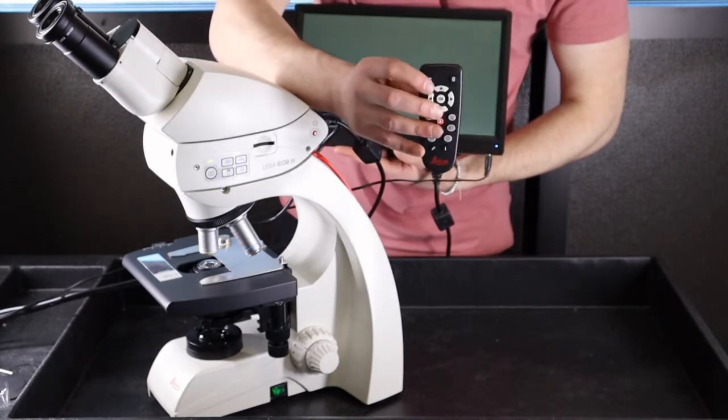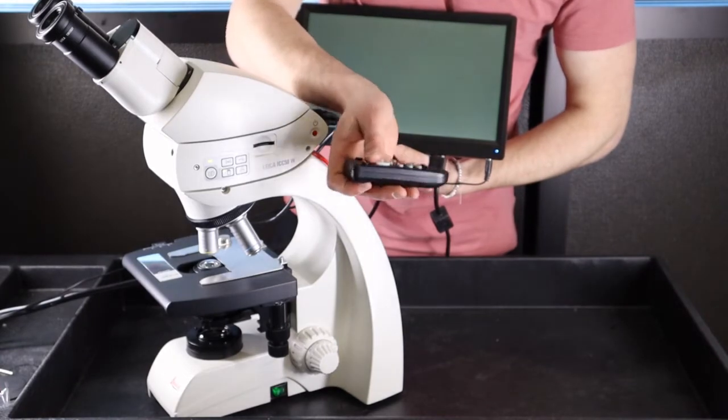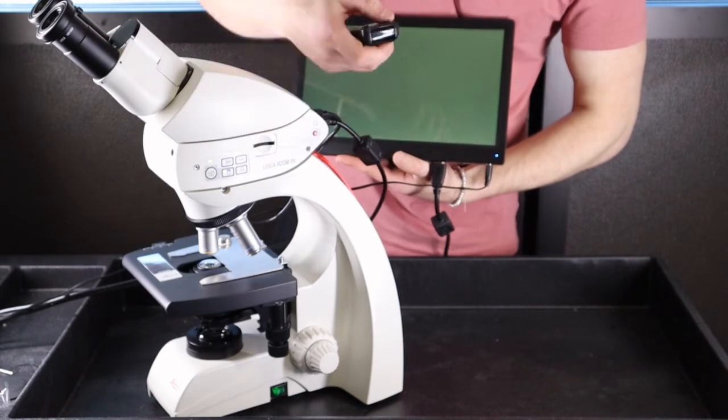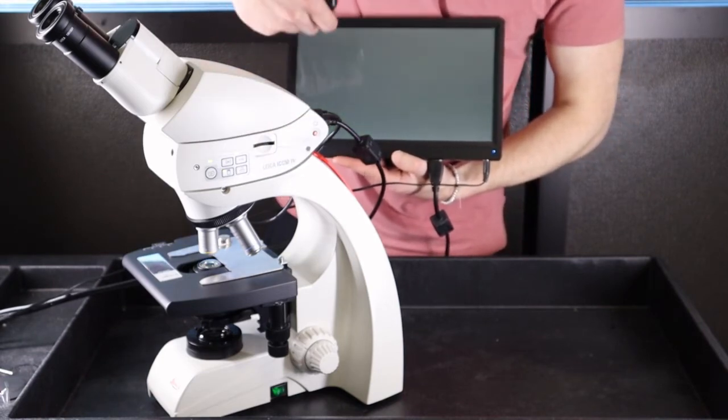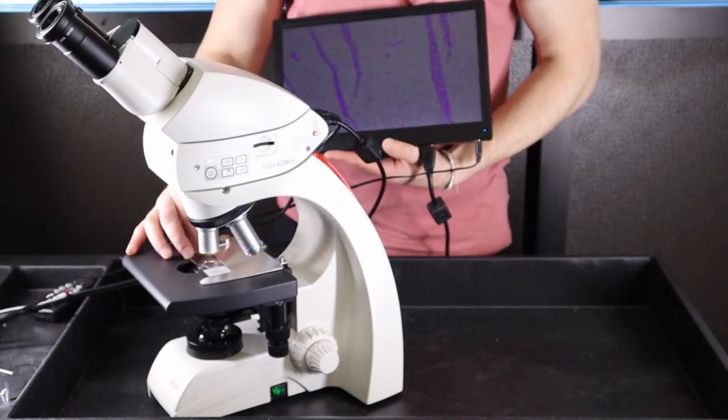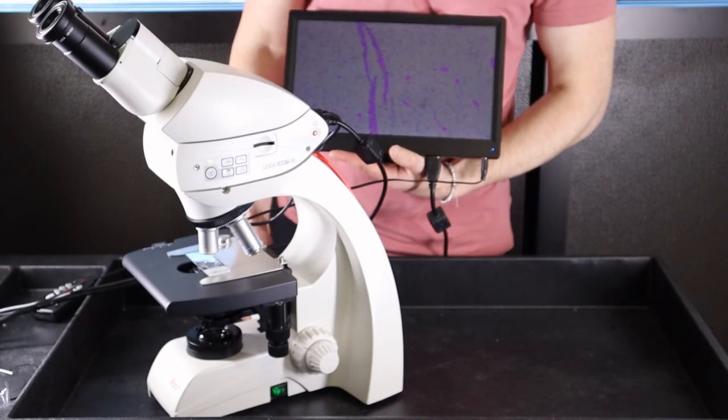The top left button is the WB button for white balance. Point the remote at the camera sensor, which is located on the front of the camera, and click the white balance button. It will say processing and you'll hear a noise. Now your camera is white balanced for more color accuracy to your sample.